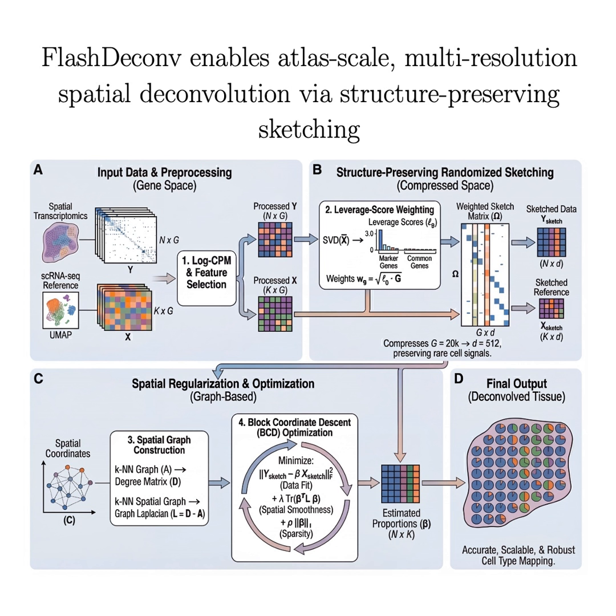That's why the horizon matters so much. If you're analyzing data above that resolution, you're not measuring biology anymore. You're measuring a mathematical average. And that mixing, you said, it can actually invert reality, the problem of spurious co-localization. This is the real danger zone.